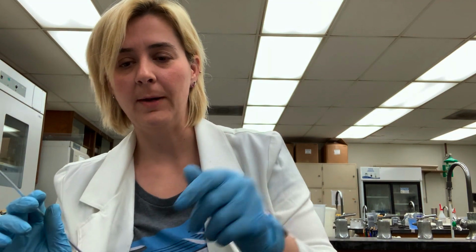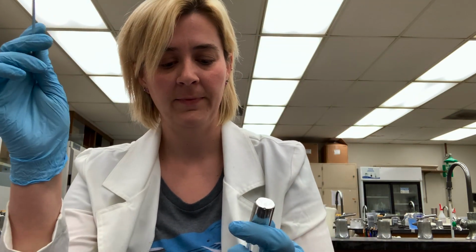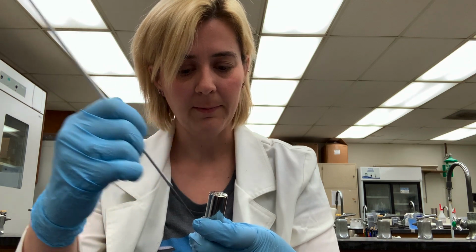Next, what I have is the streaked culture of Enterococcus. So I put a couple of drops of water on my slide, and remember, Enterococcus is Gram positive. So I'm going to grab a little loopful from the slant with my sterile loop, and mix it up with the water, spread it around a little bit, allow it to air dry. Sterilize my loop.